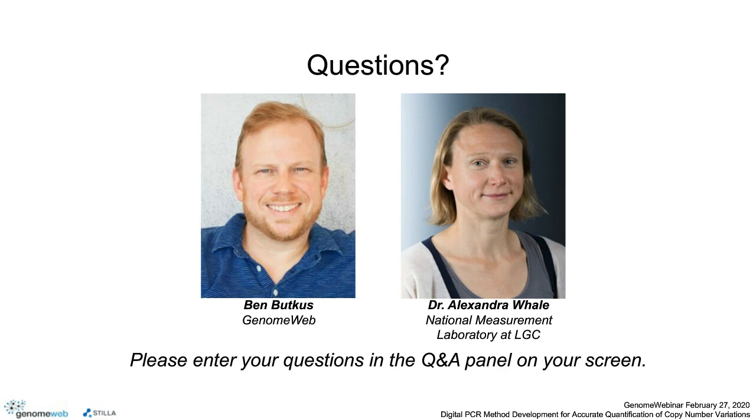It's predominantly quantitative in the sense that we can measure small changes. We can measure them reproducibly. We can look at limit of detection and limit of quantification with them. In terms of the HER2 gene amplification, it's essentially yes or no is what you need the output to be. So I would say at this stage it's quantitative, but we haven't got anywhere near the rigorous levels of assay testing and development that would meet CLSI guidelines at this point.